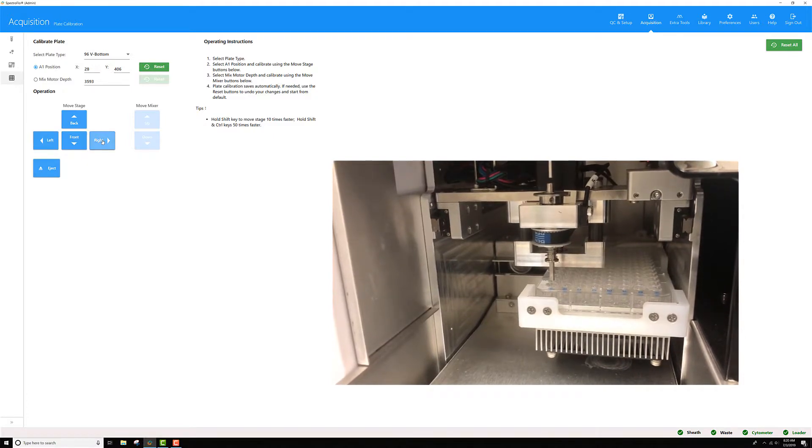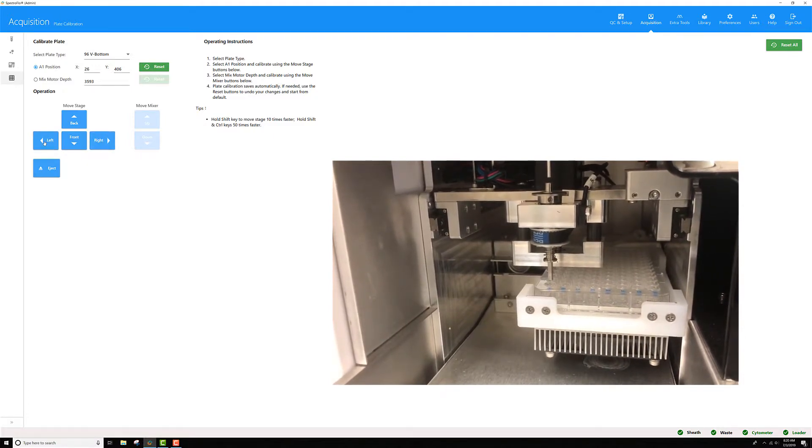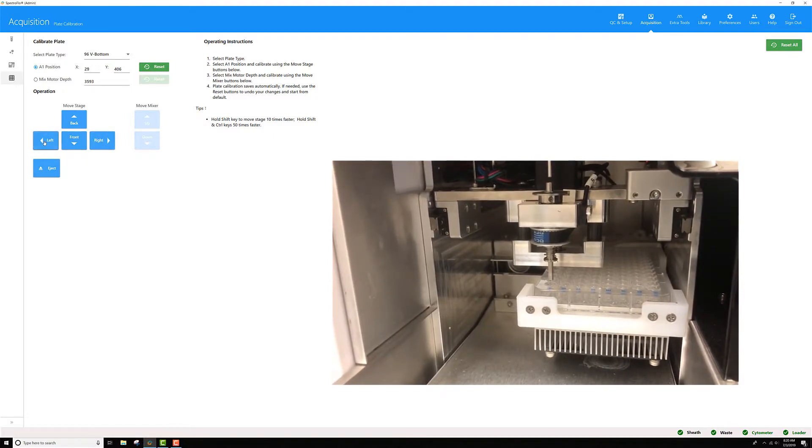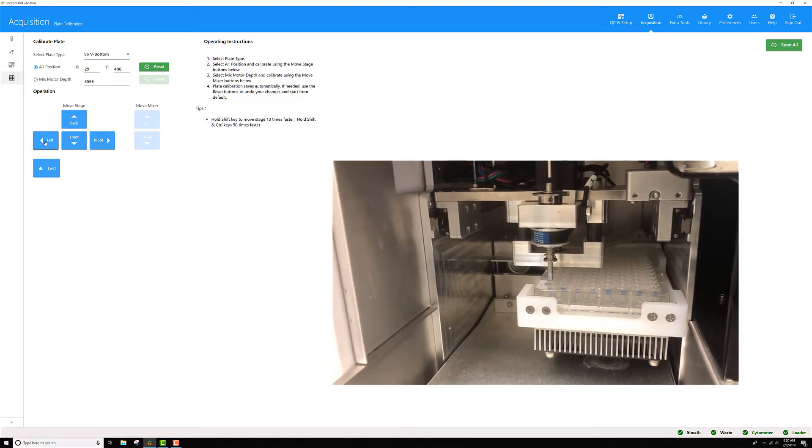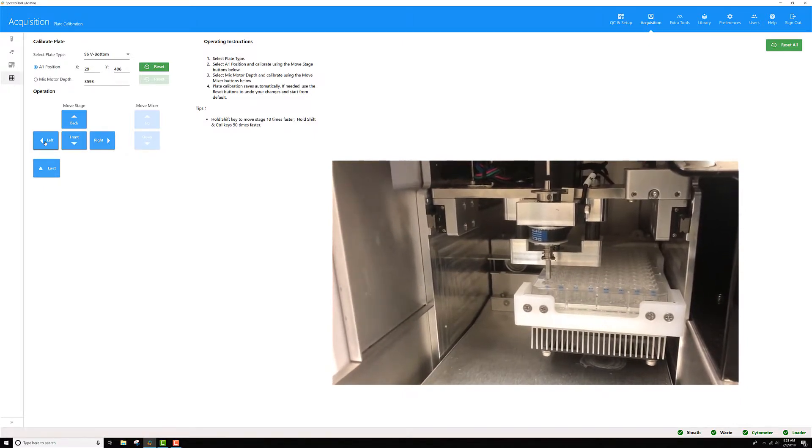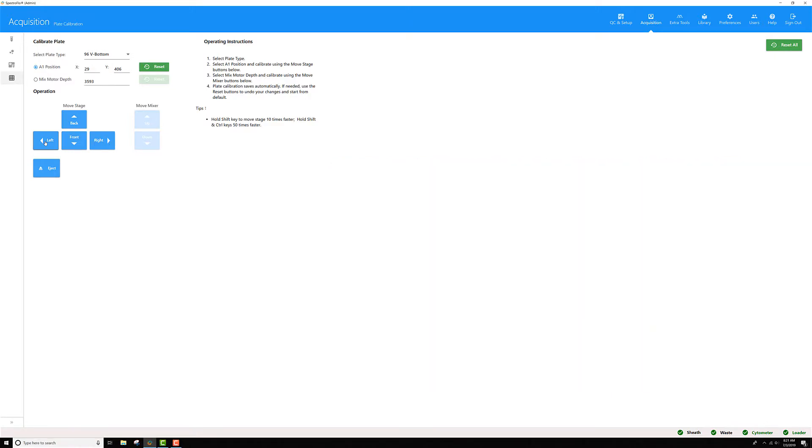If you want to take larger steps, hold the SHIFT and CTRL key while pressing the arrow keys. Once you're happy with left to right, go ahead and eyeball the front to back.